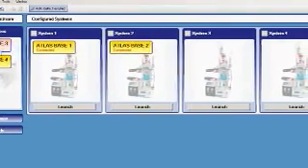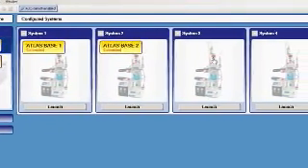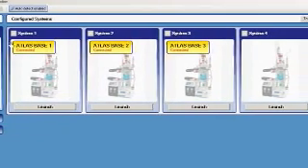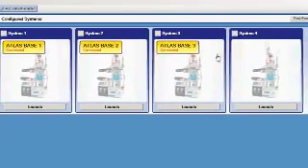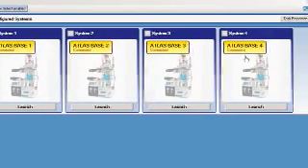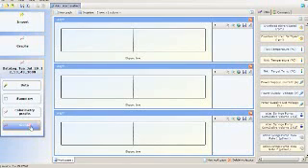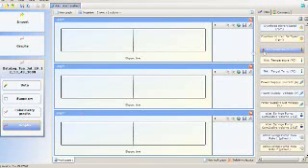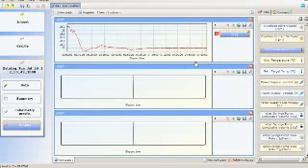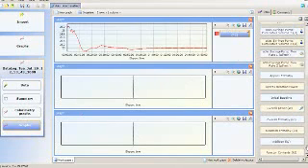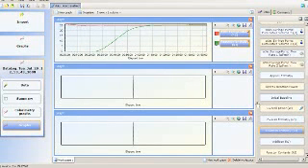Each piece of hardware is assigned to a system which can then be individually controlled. For easy analysis of data, the ATLAS reporting software allows easy graphing and display of data exported from the ATLAS base or the ATLAS software.